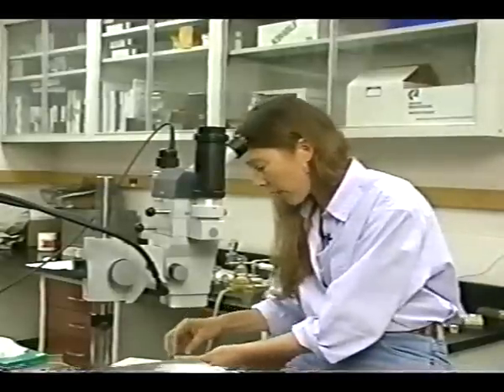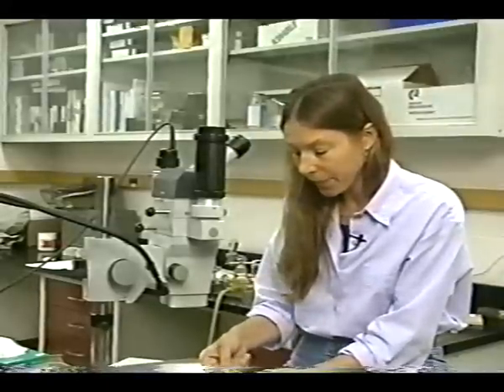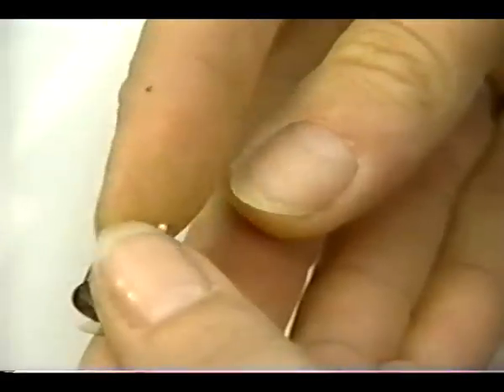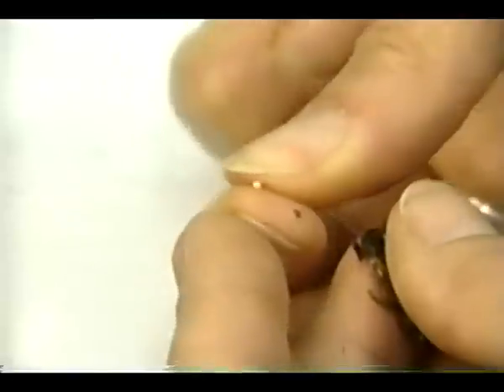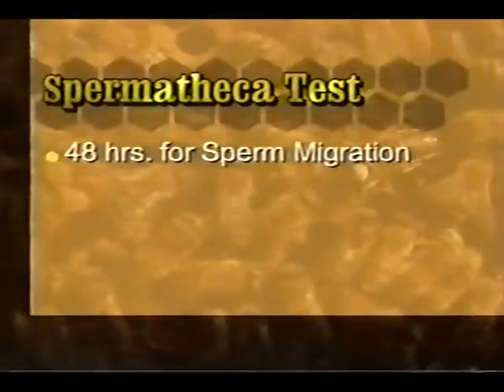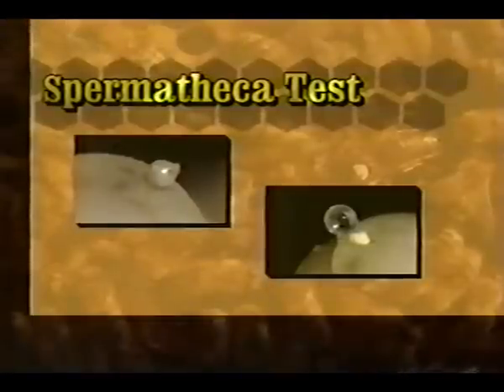This queen has been successfully inseminated. Again, pull the last two segments of the abdomen and pull out the spermatheca. Roll it in your fingers to remove the tracheal net. As you can see, this has a lot of color to it — it's the color of semen. Under the microscope you can see the creamy, marbled color and the clear difference between this one and the virgin queen. When checking the spermatheca, allow 48 hours for the sperm to migrate before dissection, and remember to remove the tracheal net. Although you have to sacrifice the queen, this is a simple yet conclusive test to establish your technique.